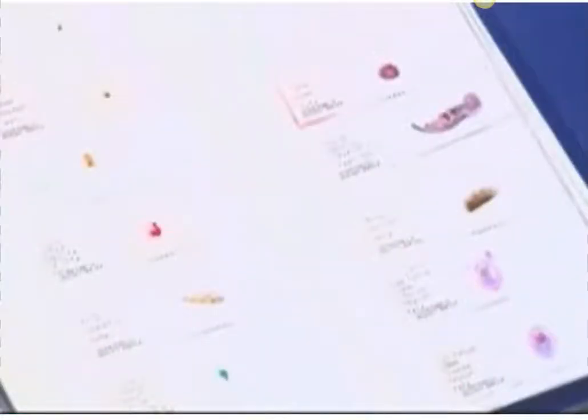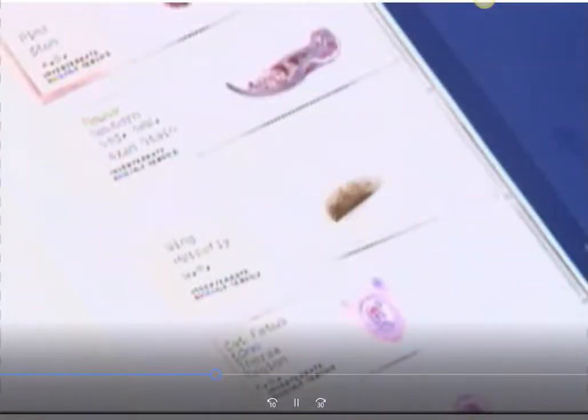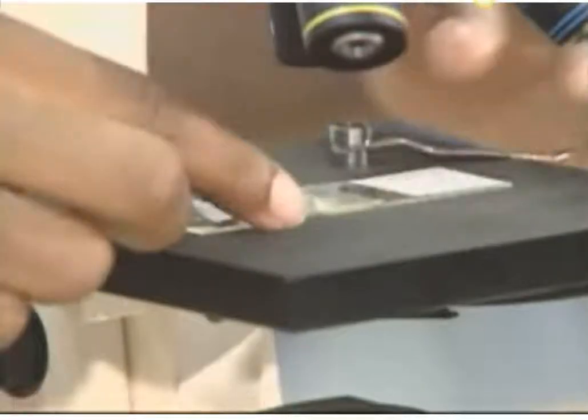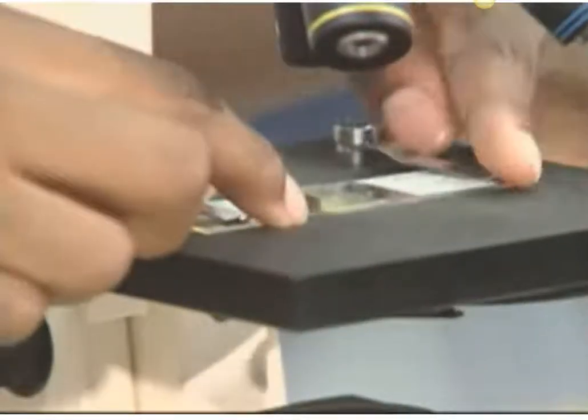Your class may have a selection of specimen slides. These are things that have been professionally prepared for study. Specimens are very thin so that light will pass through them, and some are stained or treated in chemicals so that you can see them more easily. Glass slides should be handled carefully by the edges. Select one you wish to examine and place it on the microscope stage beneath the stage clips.